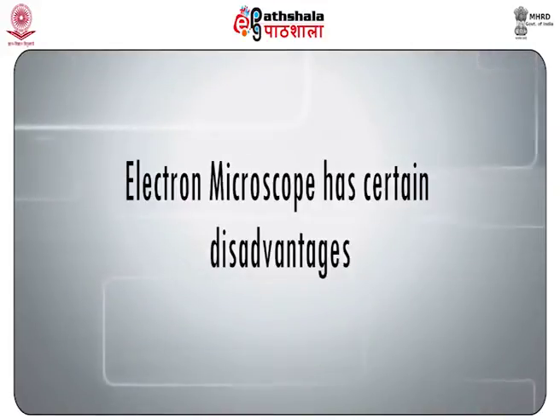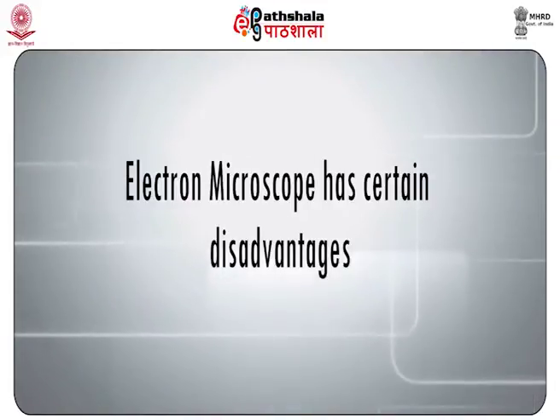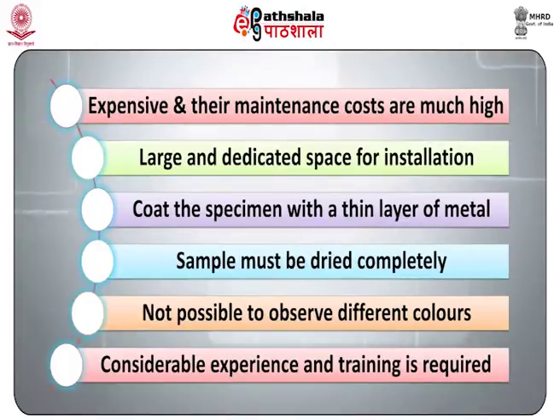However, electron microscopes have certain disadvantages: they are expensive and their maintenance costs are very high.